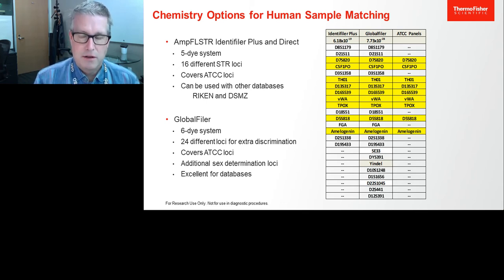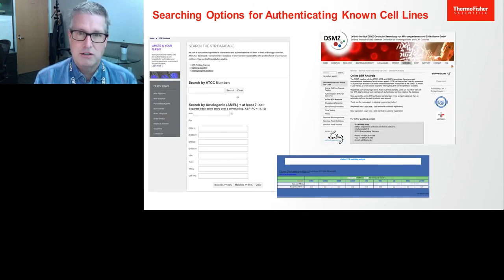As I mentioned, this makes it very easy to cross-check your cell lines and make sure that the cells in your culture dish match up with what these organizations say have been deposited into their databases.